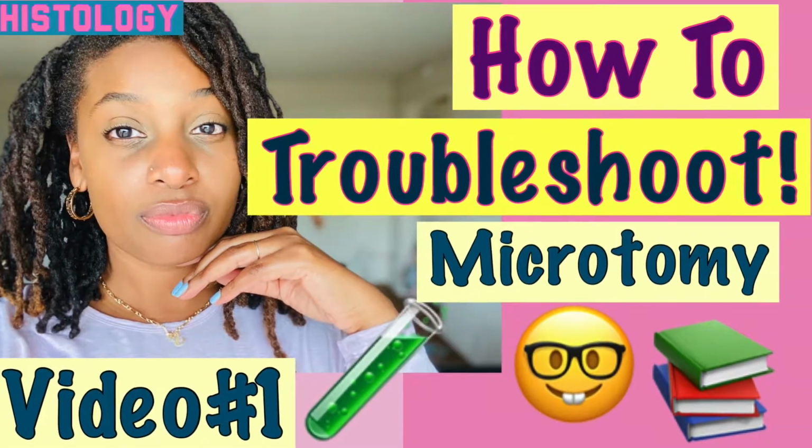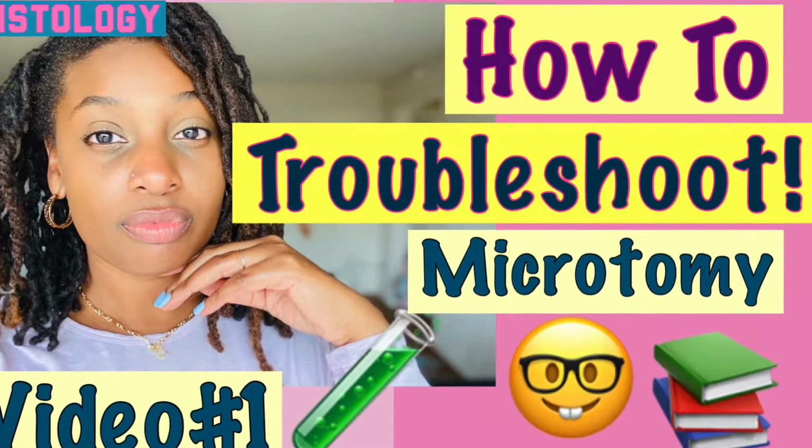As far as your tests, focus on embedding orientation, how to embed a fallopian tube, what to embed on edge, what to embed flat, how the tissue should be flush. These are all embedding and microtomy, how to get a perfect section, how to make sure you don't have any wrinkles, what happens if you have wrinkles, what to do if you have wrinkles, what happens if your sections are jammed, what happens if you have lines through your tissue. These are all embedding and microtomy test questions.